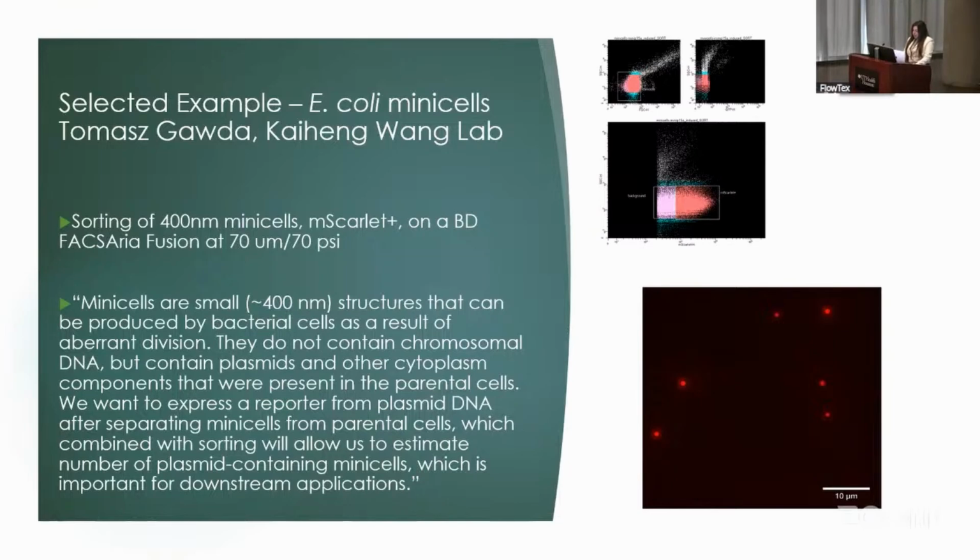Then you're going to have to dilute the sample to achieve the appropriate flow rate for the sort. So this is hard because when you're at the limit of detection, more particles can be going through the instrument than what the instrument can actually detect. So even with the low flow rate and the low event rate, you might still experience clogging of the nozzle. So that's fun.